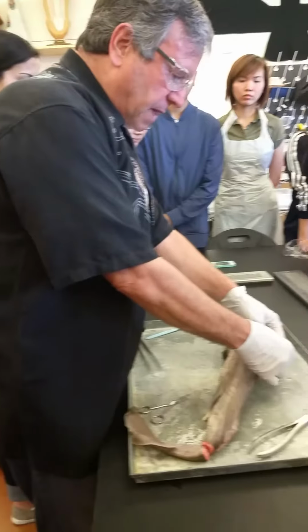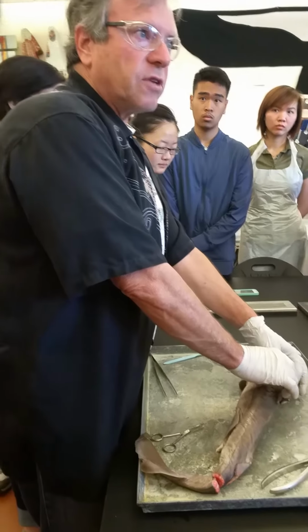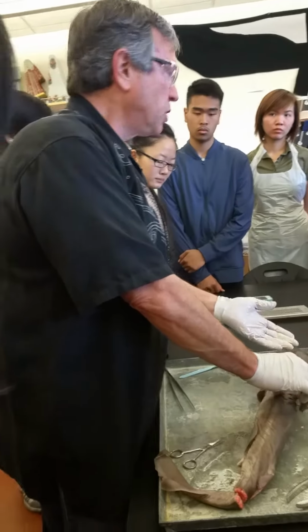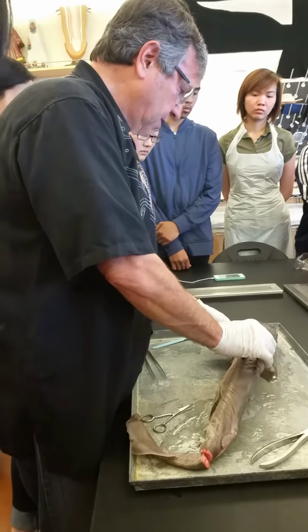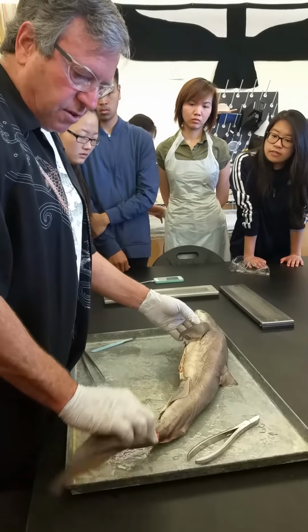bones. That was one of the reasons why for a while there was this fad going around about shark cartilage, and that was supposed to inhibit cancer and things like that, because cancer requires blood vessels, and cartilage inhibits blood vessels from forming. There's nothing special about the cartilage of sharks, they just happen to have a lot of it. Unfortunately, people are killing a lot of sharks just to get cartilage. But anyway, so some of the differences and similarities we see with these and the bony fish.